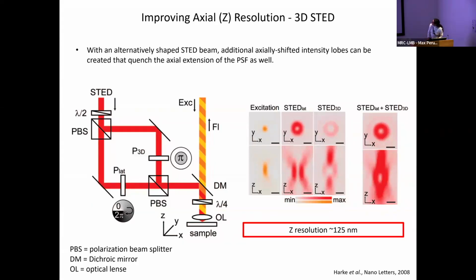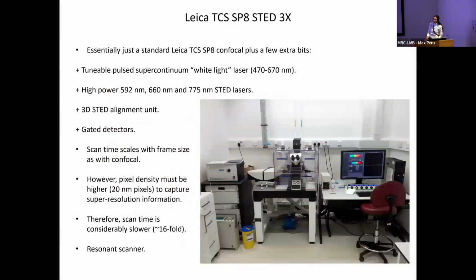Thanks. So let's switch off the intensity. And so we have also a STED microscope in the facility that is available to use, and you can see the STED laser. So we have different STED lasers: 592, 660, and 775 to be able to image green fluorescence, red and far-red fluorescence. And so as I was explaining, the STED laser is always higher in the spectrum than the emission you're looking at.